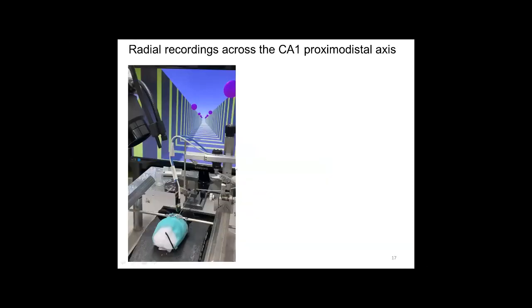So, as I said, the head-fixed prep can be coupled with virtual reality to develop different tasks. For instance, this is one of our setups. I don't know if you can see this small movement. Basically, it is simulating the fact that when the animal moves the wheel, they run across a virtual corridor, and then you can couple that with whatever combination of stimuli you want, and you can design your own tasks, and the animal learns to do that.